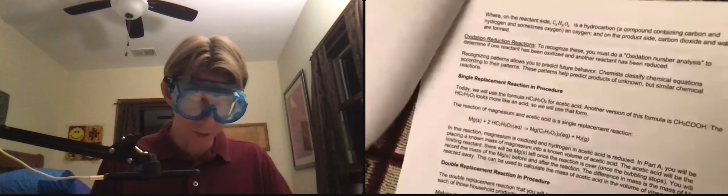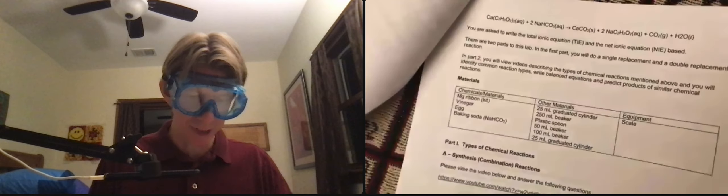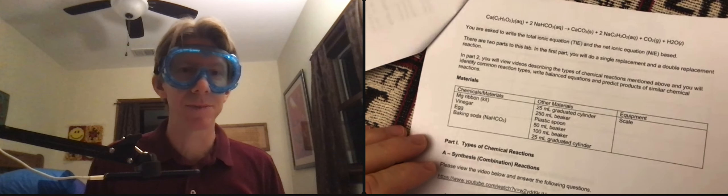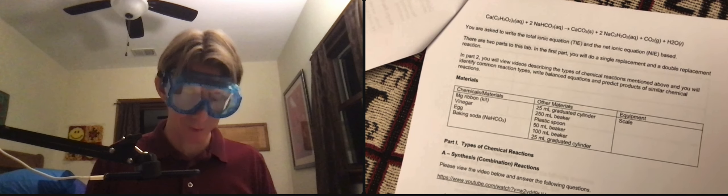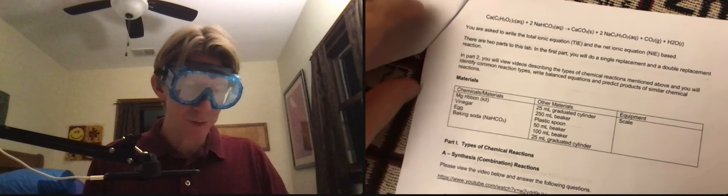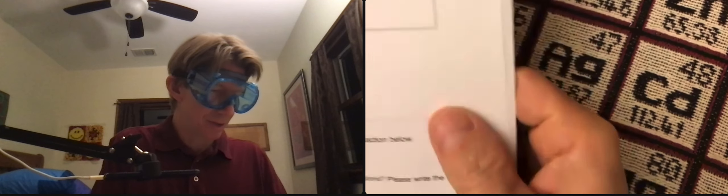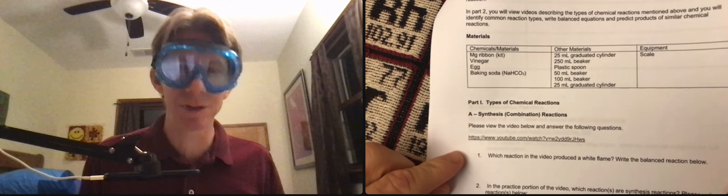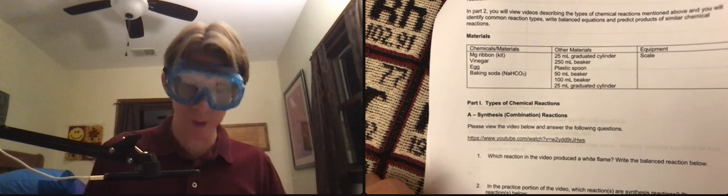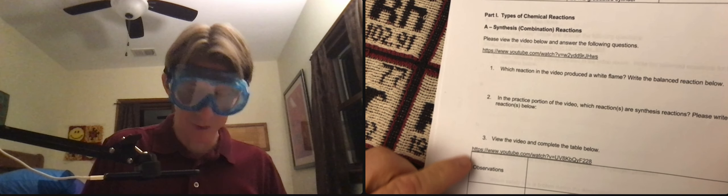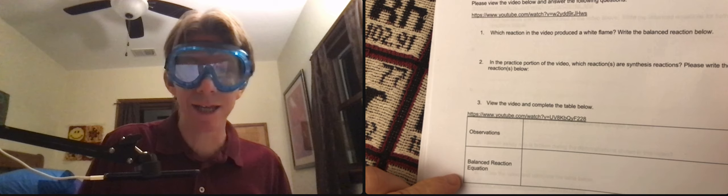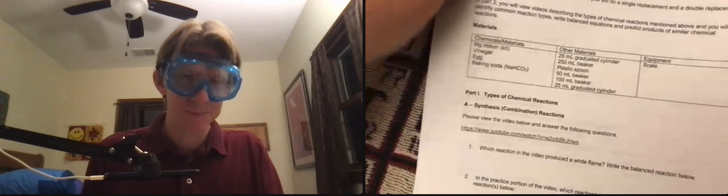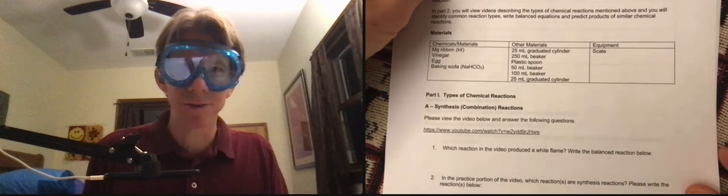The videos themselves I think are relatively straightforward, but I'm always open to preparing some additional video help or answering any questions of course. Let me go through my materials list here for part two. You can see part one is types of chemical reactions. You're going to watch a video, answer some questions, watch a video, write your observations, and then a balanced reaction equation. But enough of that. Let's make sure we've got all of our materials.